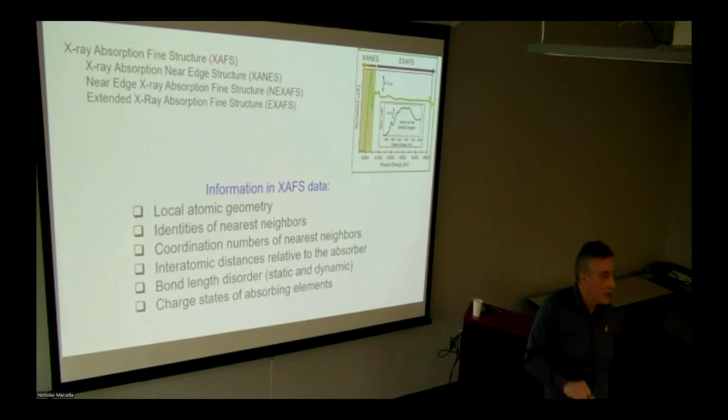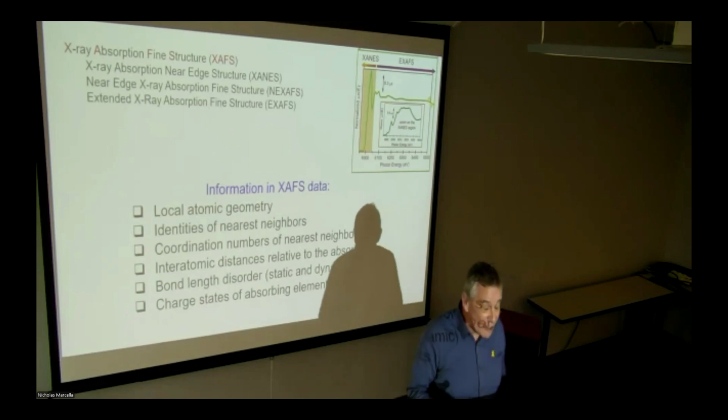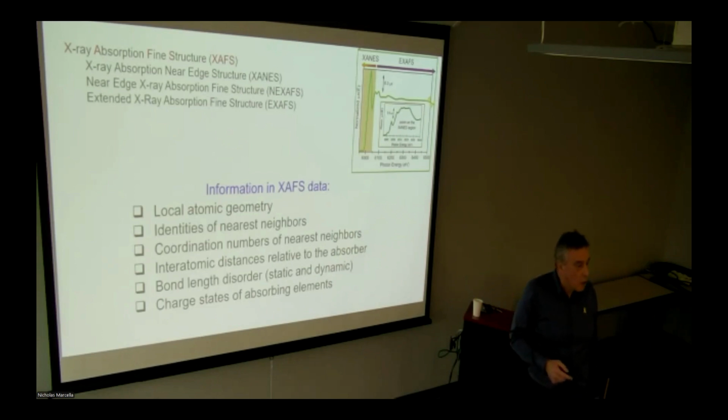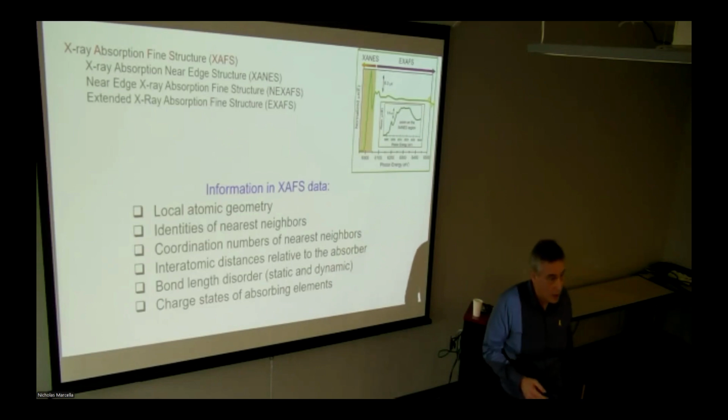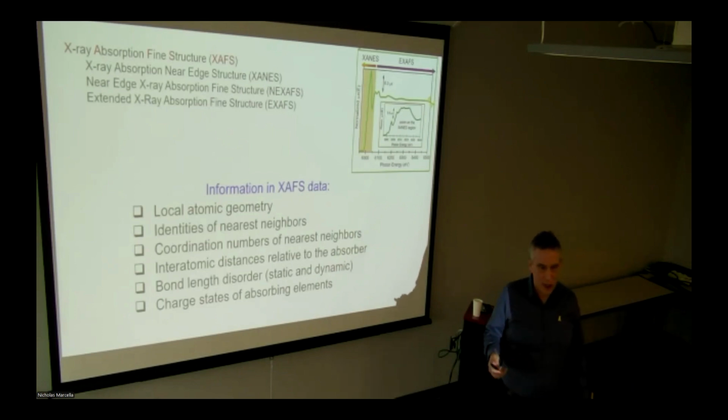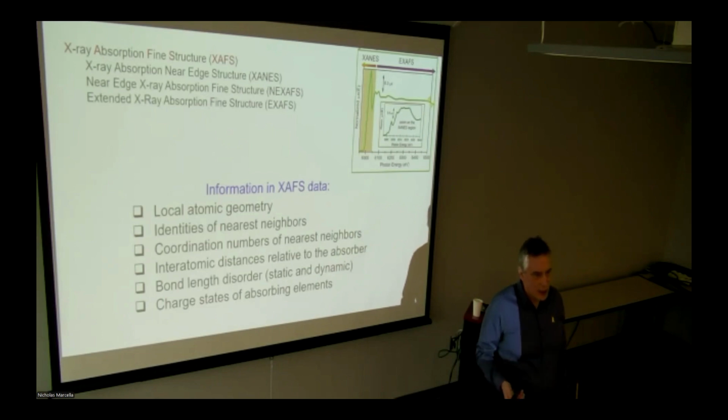But even in X-ray diffraction, we can see this result, because it will affect the intensity of the Bragg peaks due to the Debye-Waller effect. This is because of the thermal ellipsoid that causes displacement of individual atoms from the lattice position, even in the perfect lattice. And XAFS also has sensitivity to the disorder. And here is something that probably I don't have time to discuss at length, but it also comes to the question of what a given characterization technique can do in terms of its intrinsic characteristic length and time.